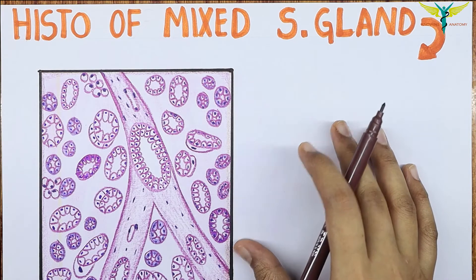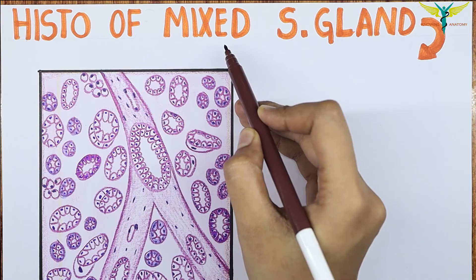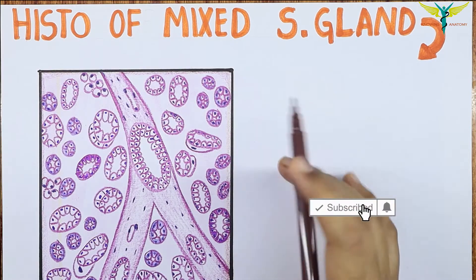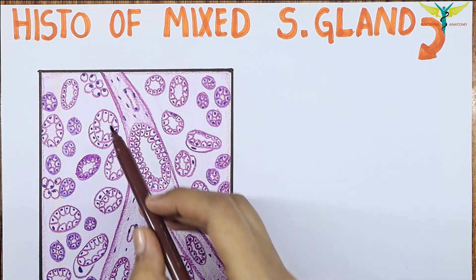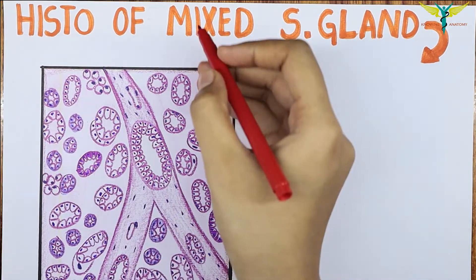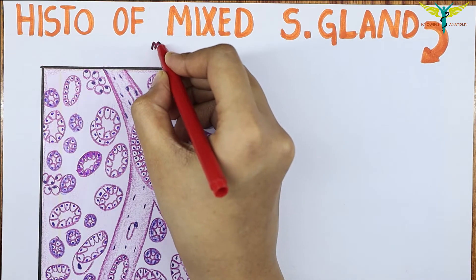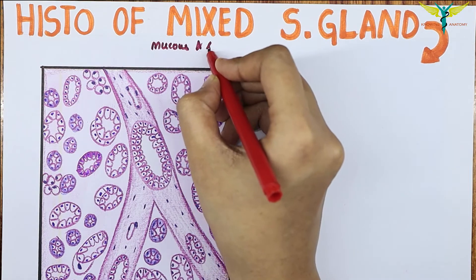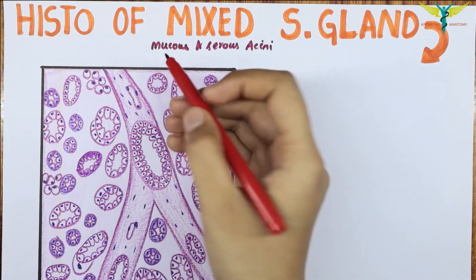In this video, let's learn about the histology of the mixed type of salivary gland. In a mixed type of salivary gland, you can notice the presence of the mucus acini and the serous acini. So the mixed type of salivary gland means it contains both the mucus and the serous acini.